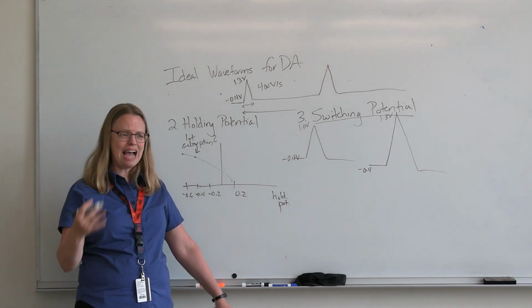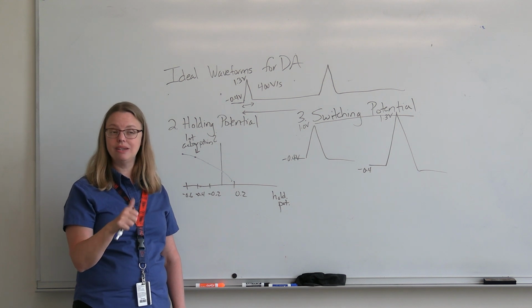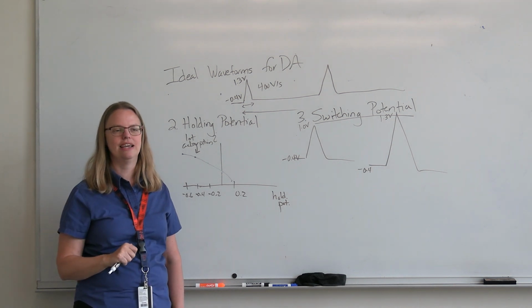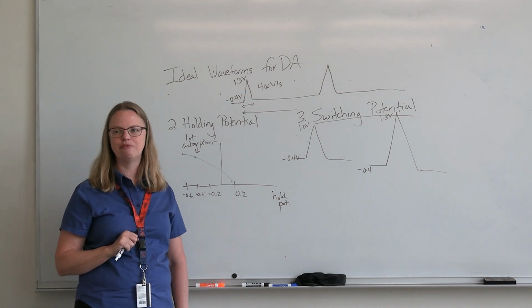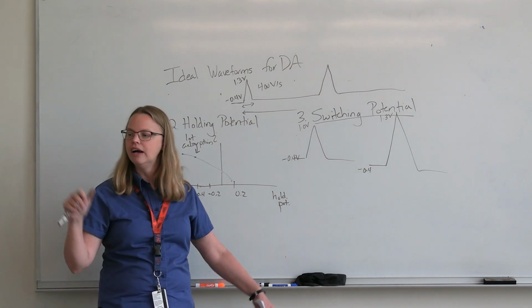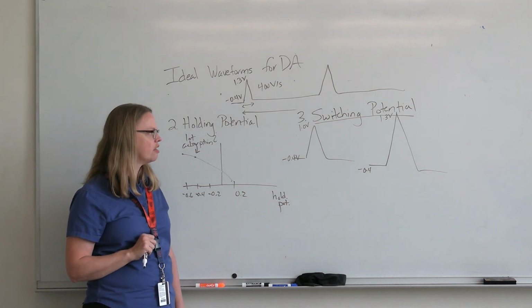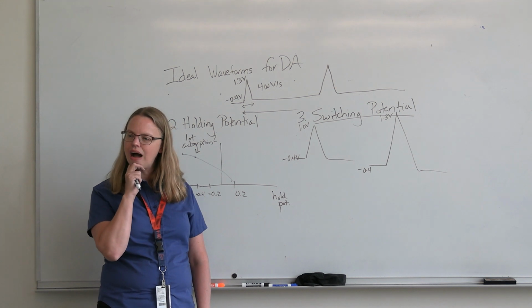And you say, what happened? I think a couple things happened. Number one, the amplifier might have been limited to 1.0 back in the day. If you think about putting things on a 10-volt scale, 1.0 goes really nicely. When we've looked at buying other equipment, sometimes we're like, that's fine, but I can't get you over 1 volt. And now I'm like, I don't want any potentiostat that doesn't get me over 1 volt. Back in the day, I think the potentiostats were a little bit limiting, to 1.0 volts. But there's an inherent question of why go higher?